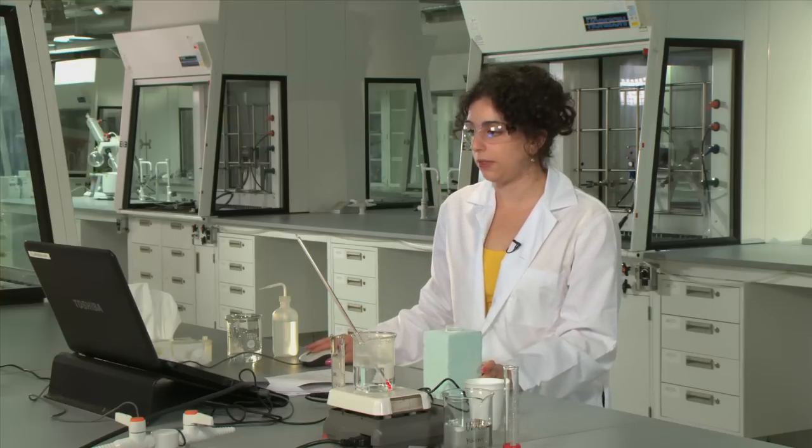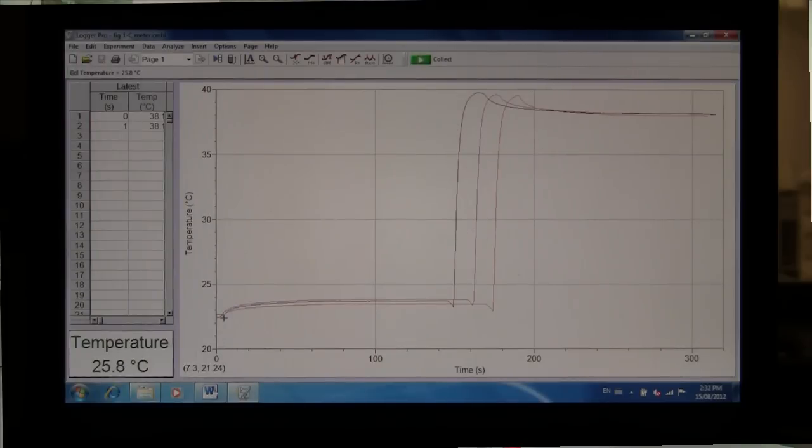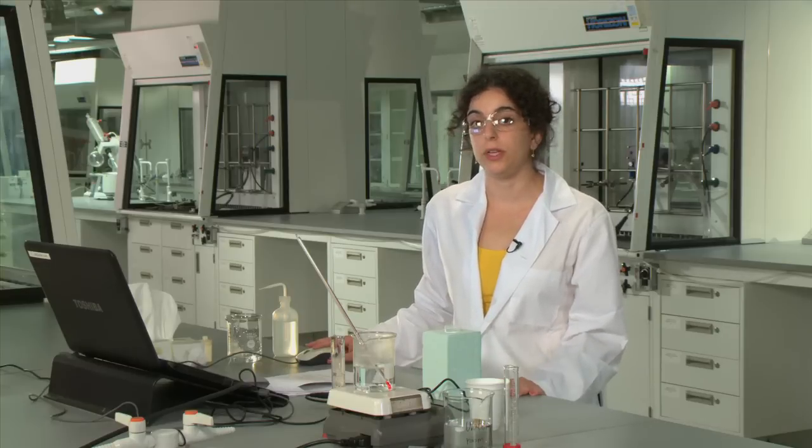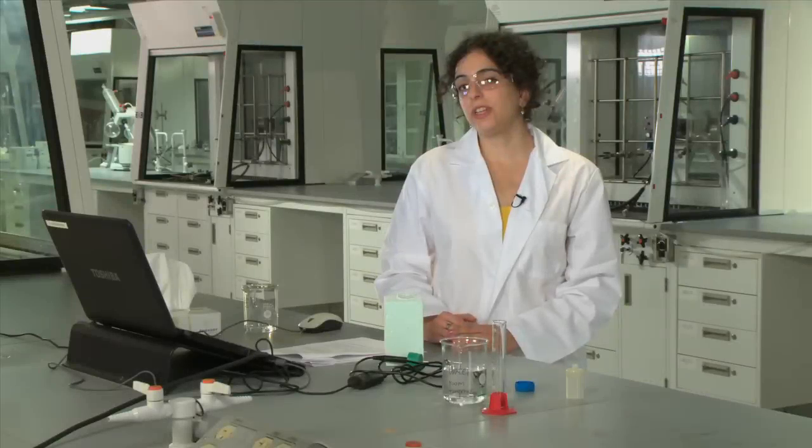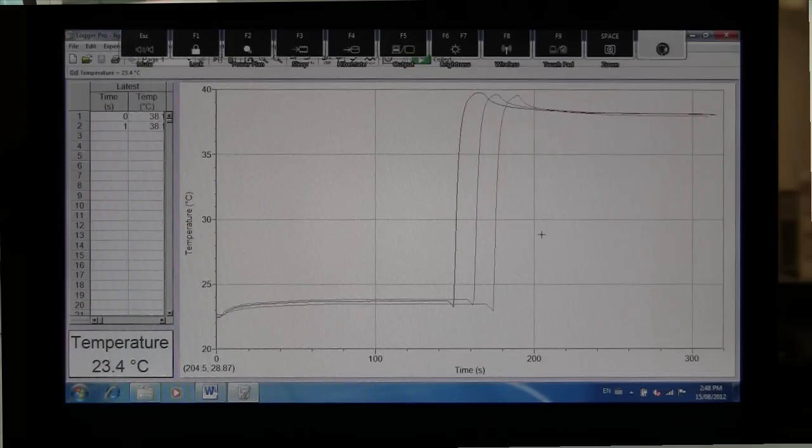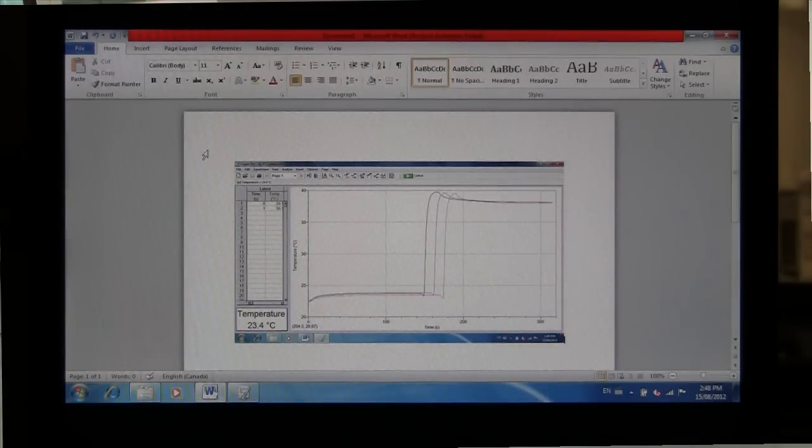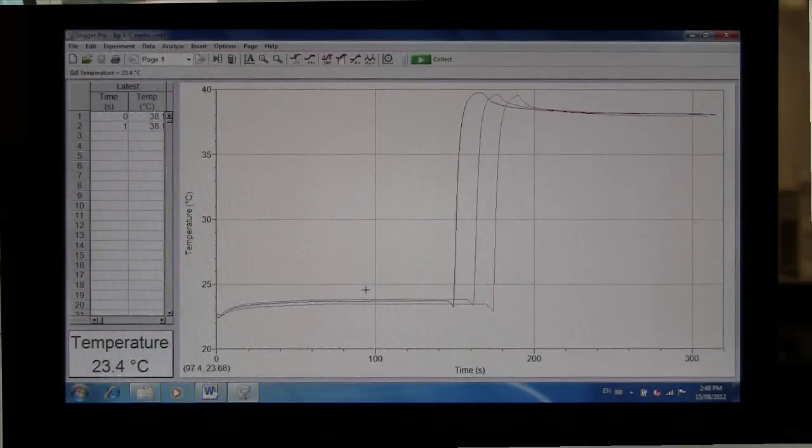So as mentioned before you'll repeat this twice more to get three trials of this collection and your graph should then look something like this. You've got your three trials here showing the temperature of the cool water just before the hot water was added and then the temperature shot up and then stabilized over time representing your final temperature. Make sure that you've recorded the initial temperature of your hot water in your coffee cup before transferring it into your calorimeter. Once you've collected all three trials for determining your heat capacity of your calorimeter you're going to print screen the view on your laptop by selecting function print screen and then pasting the file in a word document.